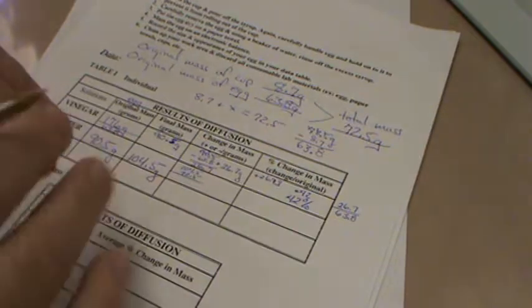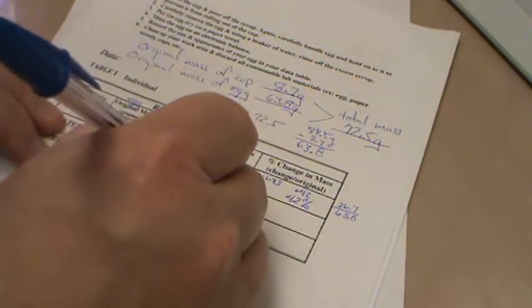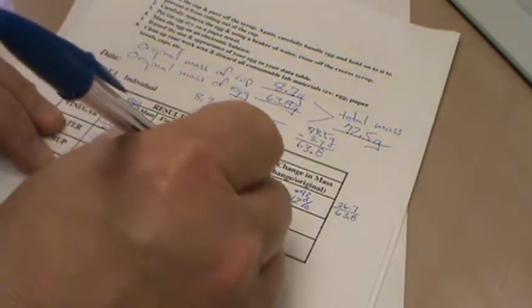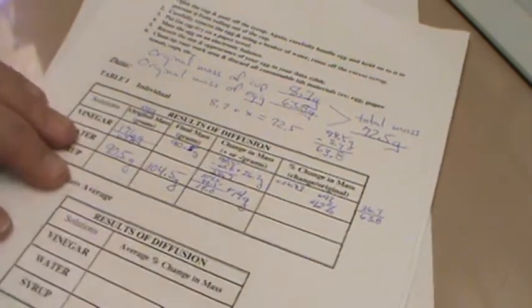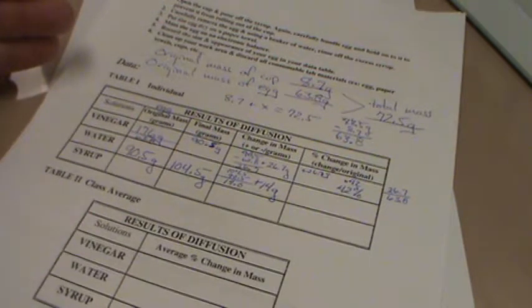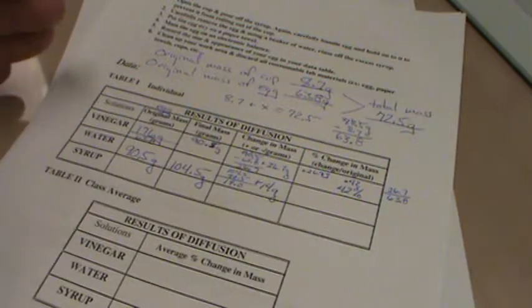So 104.5 minus 90.5. Yes, I know there's some of you already shouting at me. It's 14. I get it. So that is a 14 gram increase just because the vinegar was 95% water and the distilled water was 100% water. Just think of that. Only a 5% change in the amount of water molecules available, but yet we had a 14 gram increase.